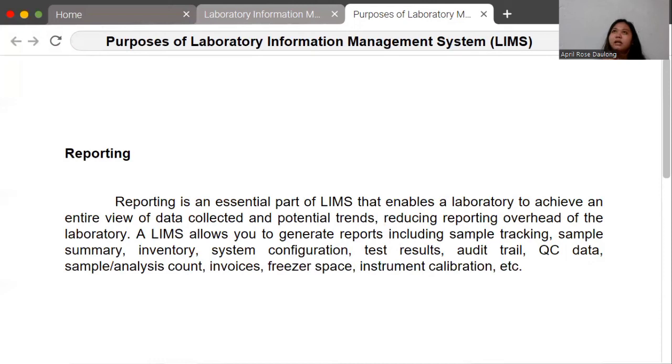Summary about the results, test results, samples, na accurate ang iyang produce. Kay since hindi siya kapareho sa manual, dili makaproduce og accurate kay basi magkamali og input sa mga data.